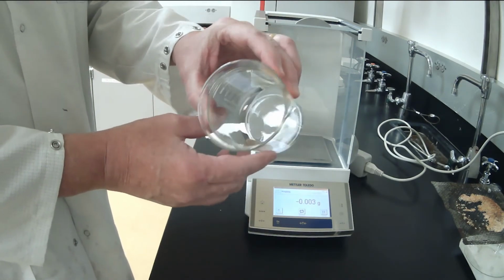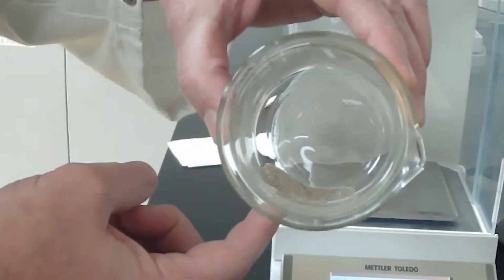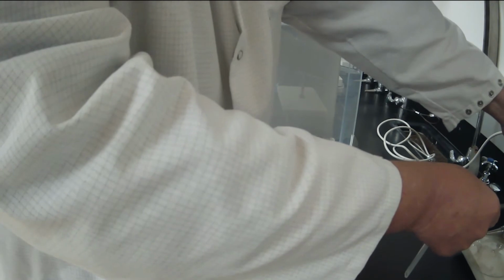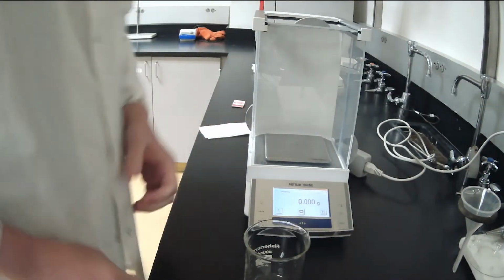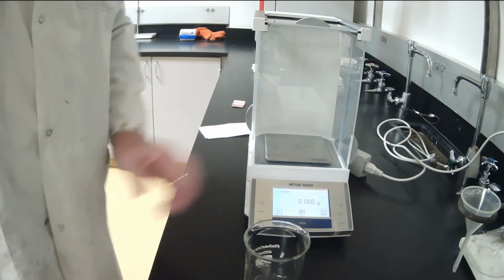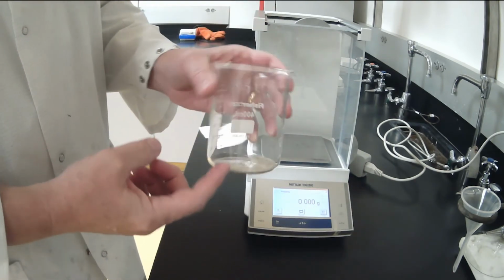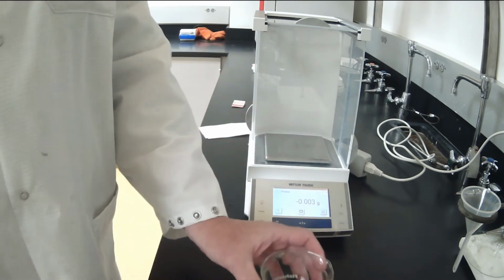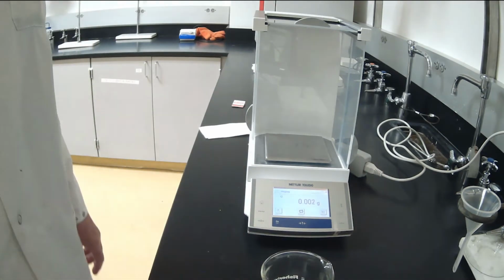I'm going to see if I can tip it over, but you see there's a pile of sand and sodium chloride in there. They're mixed together. So to separate these two, we're going to take advantage of a physical property called solubility. The solubility of sand in water is, for all intents and purposes, nothing. Sand never dissolves in water, whereas the solubility of salt is pretty high, and we can eventually dissolve all the salt out of this mixture if we use some water. But before we do that, we have to weigh two more objects.